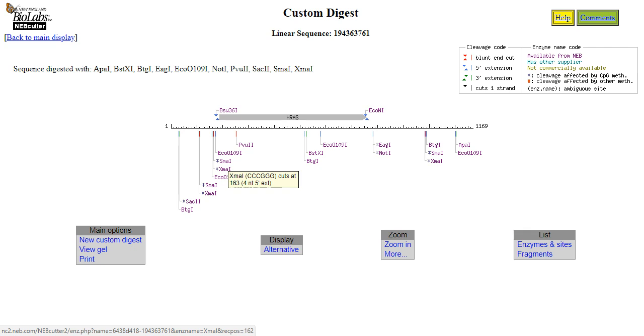From the enzymes above, we're going to go downstream of the open reading frame. Okay, so we've got these two that are really close, and they cut at the same site. So I could use either of them. What might be my deciding factor? They recognize and cut the exact same site. No one's better than the other. If I'm in a lab, why would I choose one over the other? They cut exactly the same spot. Simple. Which one's cheaper? Okay? Comes down to money. Right? Being a research scientist requires great frugality.